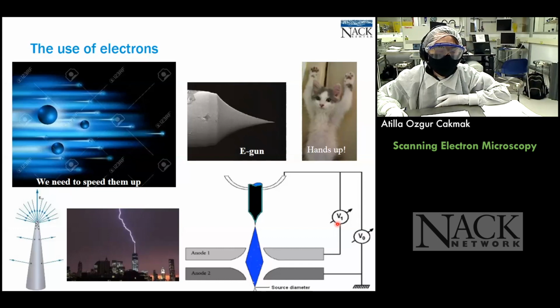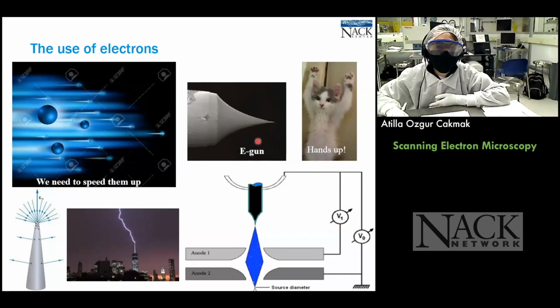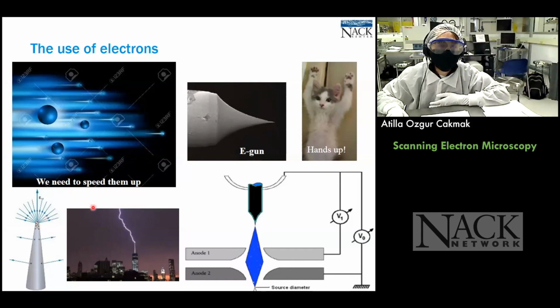You can think of it as a force, an electric force, okay? What is that force going to do? That force will extract those electrons, will capture those electrons away from this metal. So this is what's happening. This tip is so sharp that it will create this lightning rod effect, and we will capture those electrons, set them free, and there we go. We'll get our William Wallace electrons.